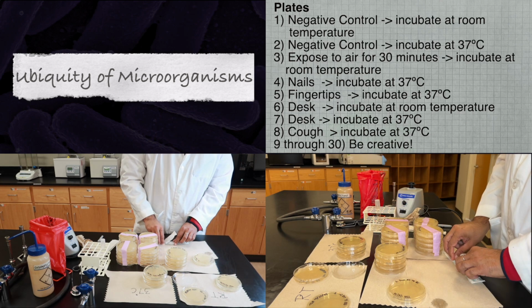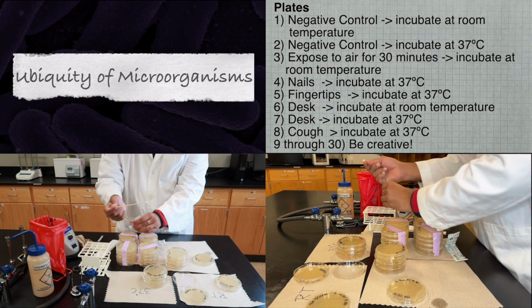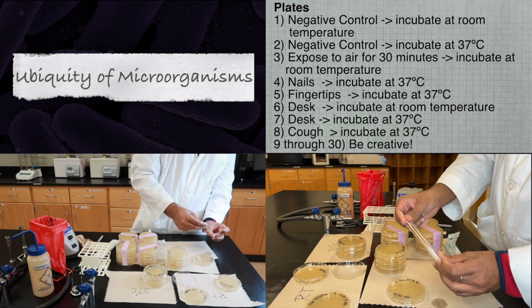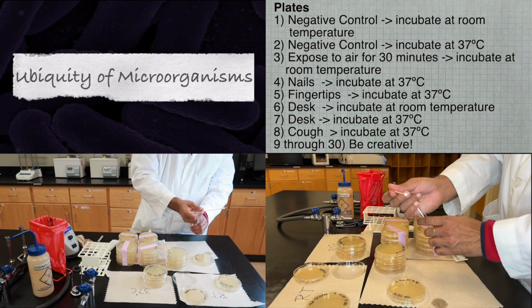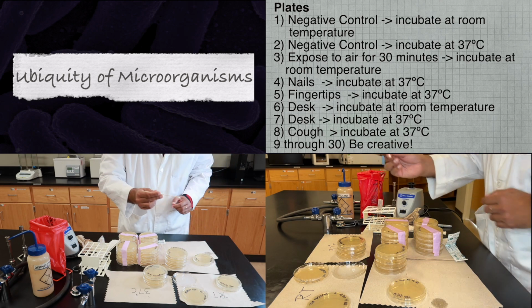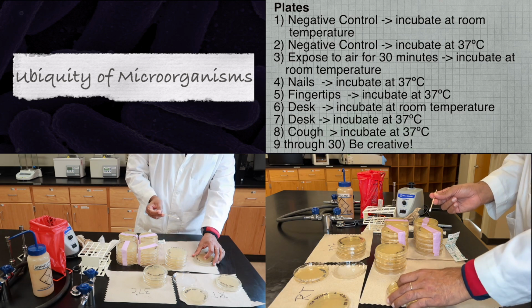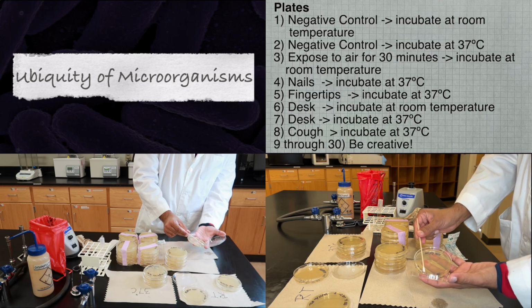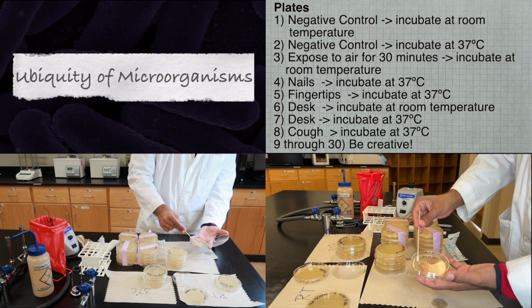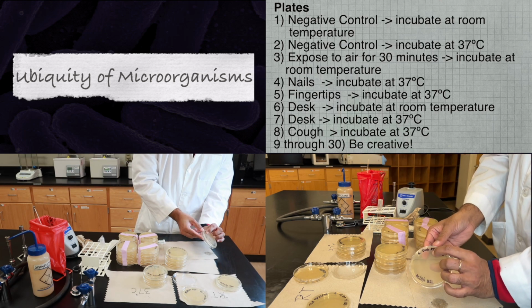For plate number 6, please take a new sterile cotton swab and dip that sterile cotton swab in your sterile water. Proceed to wipe along the edge of your bench with the cotton swab. Wipe the cotton swab across the agar surface. And then incubate plate number 6 at room temperature.